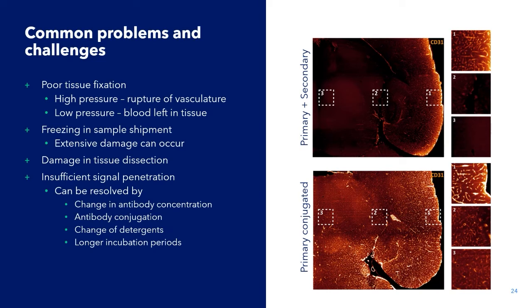And there are, of course, some other possibilities that one can take. For instance, changing the antibody concentration, using more or different detergents to enable better penetration, or just incubating longer. This usually helps to achieve nice imaging results.